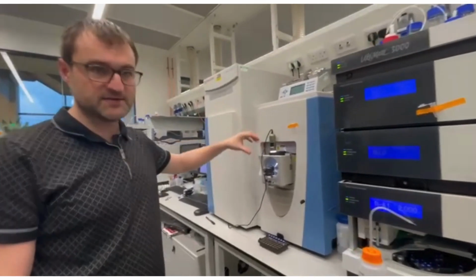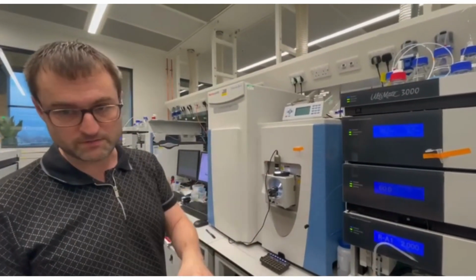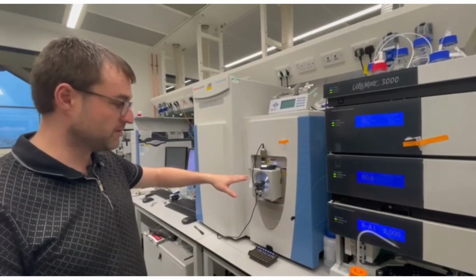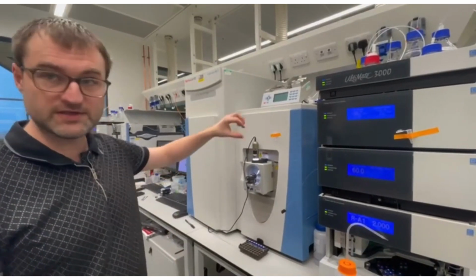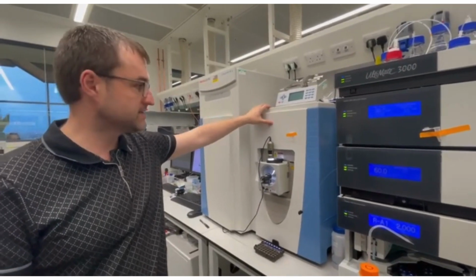The mass spec is a device that analyzes ions, and analyzes them in vacuum. So as peptides elute from the liquid chromatograph, they need to be turned into ions. Those ions need to go into vacuum, and then they get analyzed by the mass spectrometer.